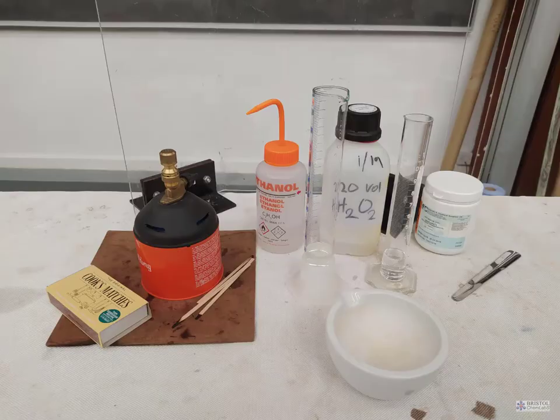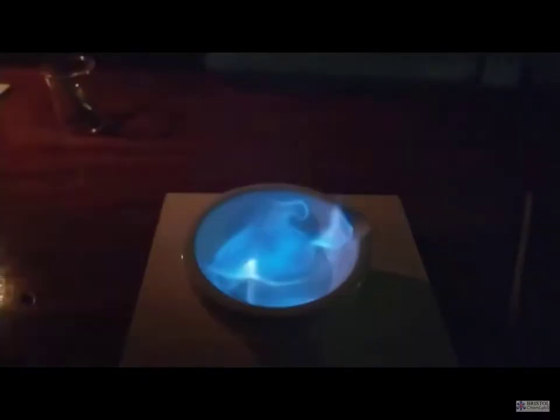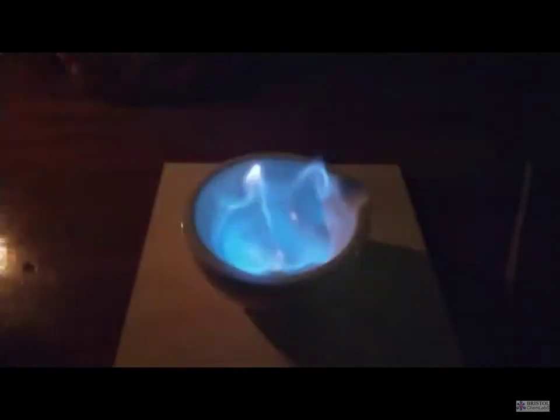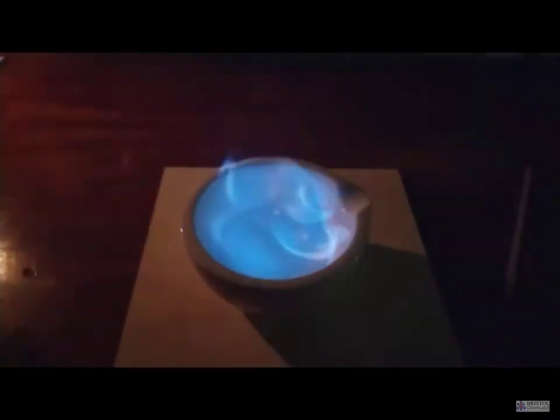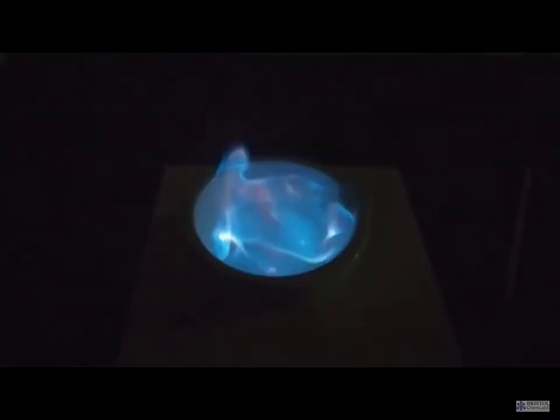30 cubic centimeters of 20 vol hydrogen peroxide are mixed with 20 cubic centimeters of ethanol. Ideally this would take place in a large crystallizing dish or evaporating basin, or you may make do with a very thick mortar from a pestle and mortar.